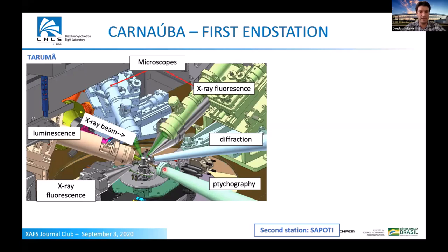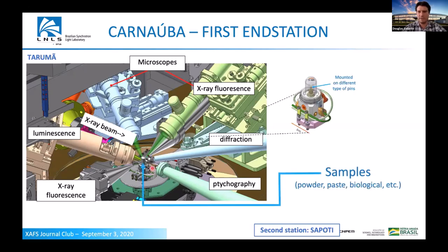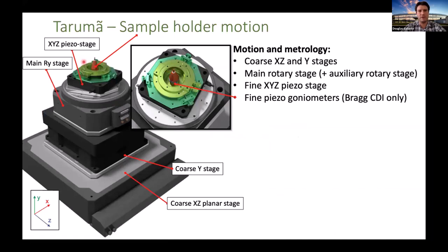And we have a crystal analyzer here for high resolution emission spectroscopy. And we have the imaging detectors here, the MobiPix and the Pymega, for CDI and for the diffraction. And these are on rails, so they can go about here to cover large two theta angles. And this is fully mounted on a goniometer. I'm sorry, let me show here. So they're fully mounted on a goniometer, and with high resolution piezo stages with interferometry, we achieve nanometer resolutions.